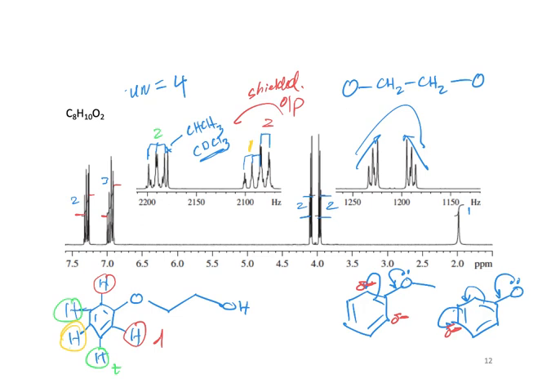But the red ones, they look pretty shaggy on there. So I think that's from the magnetic non-equivalence. But they could also have ortho coupling. But if this has an ortho and a para, that's where the non-equivalence comes from, right? The meta coupling to the yellow one, that is just a first order coupling. The one thing I forgot too, I'm going to stop this and I guess.